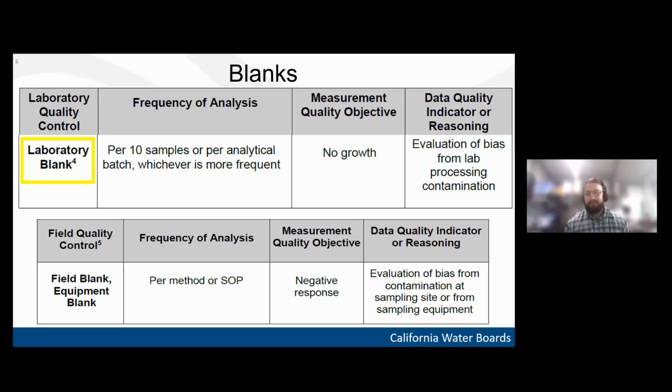So laboratory blanks are only necessary to be reported when a dilution is made in the laboratory. So if you are diluting across different sensitivities, you do need to report a laboratory blank to ensure your lab is competent and capable of not introducing processing contamination.